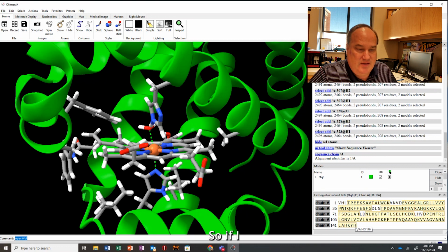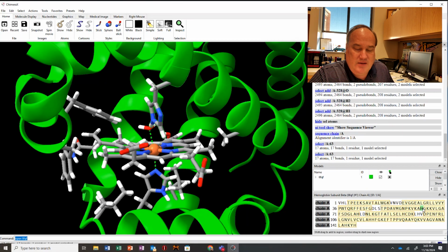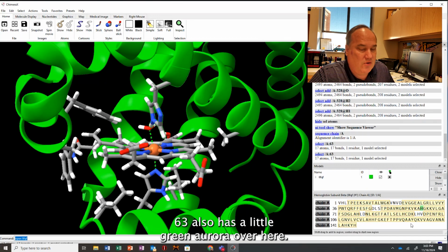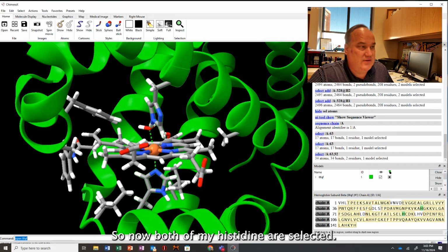So here are the 1-letter codes, and we go from 1 to 146. I want to find histidine 92 and histidine 63. If you hover over it, there's proline 58, and then there's histidine 63, and I can select it here. When I selected that, notice that histidine 63 also has a little green aurora over here. Then press Shift and Control at the same time, and let's find histidine 92. There's histidine 92, and let's select that. So now both of my histidines are selected, right?